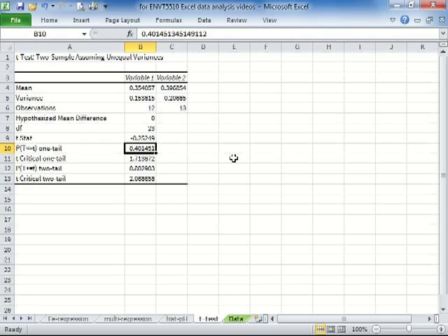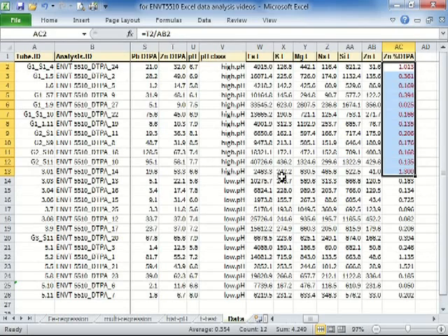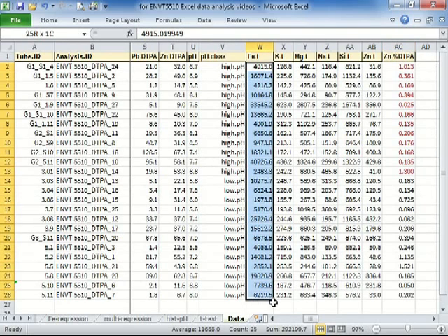And we could potentially have a look at the histogram for iron and see if that's splittable into two classes as well. Or we could just decide what represents high iron and low iron. We have a look at the data, we have a look at iron, we see there's a range of values there, and we say, okay, anything above 10,000 is high iron, anything below is low, and we make a comparison. Okay, same sort of process.